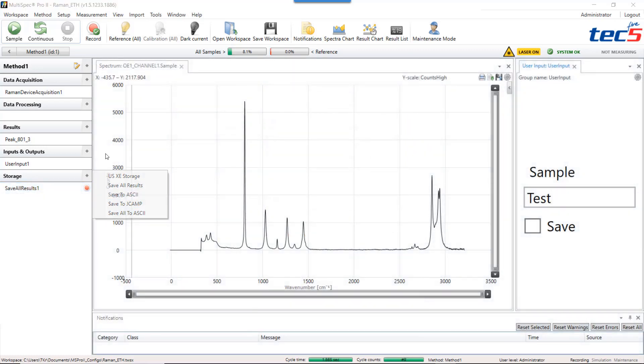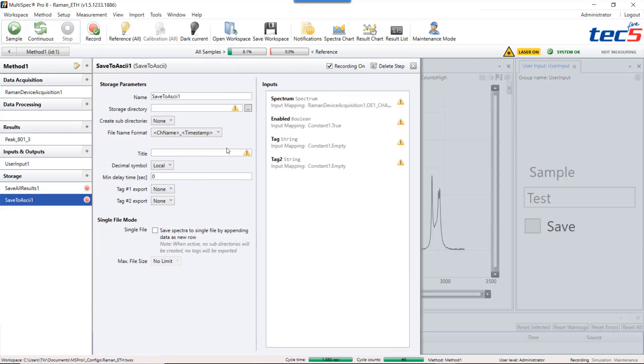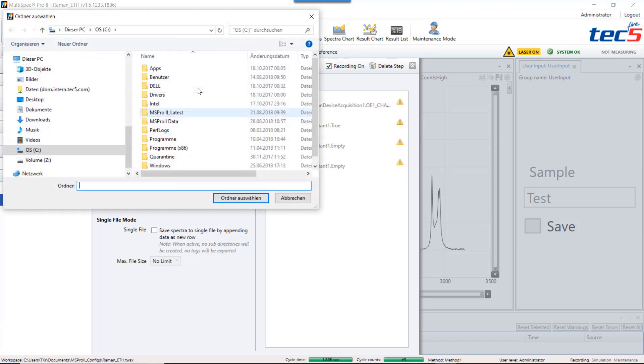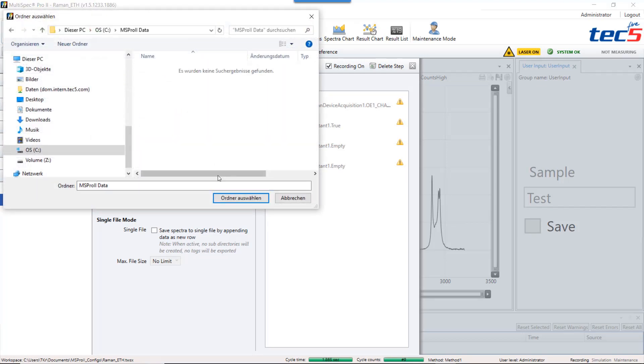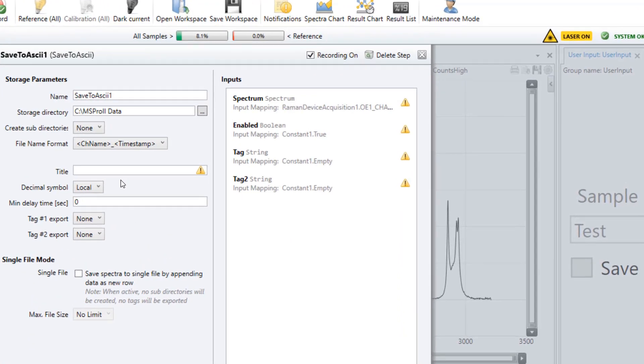You select it and press continue. You have to select a storage directory. In addition Multispec Pro 2 requires a title which I set as Raman.